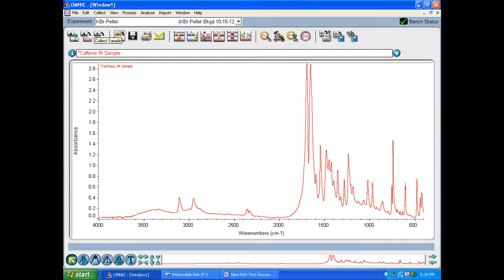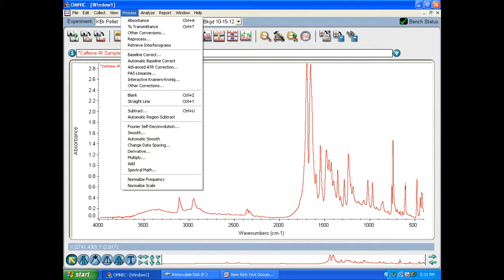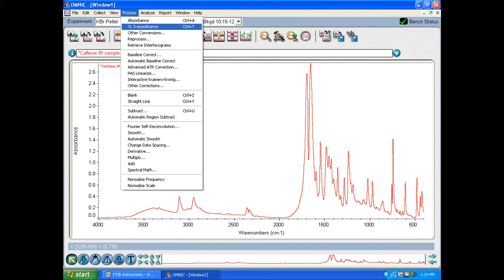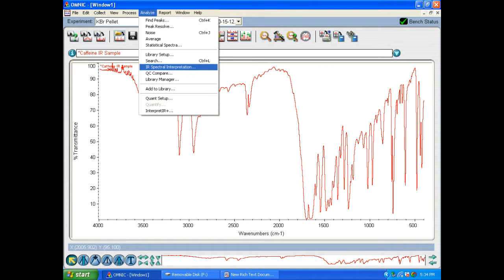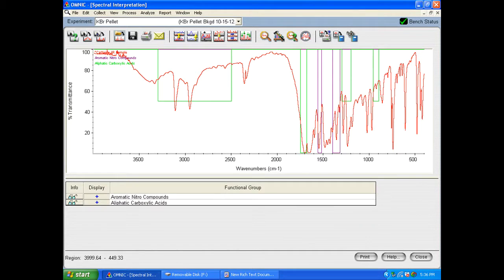Now that we've gotten rid of that old spectra, now we can turn this one into percent transmittance by going up at the top to the process tab and go to percent transmittance and click that. And this is what your spectra will look like after you've adjusted for the percent transmittance. So all of the different peaks here correspond to different functional groups within the molecule.